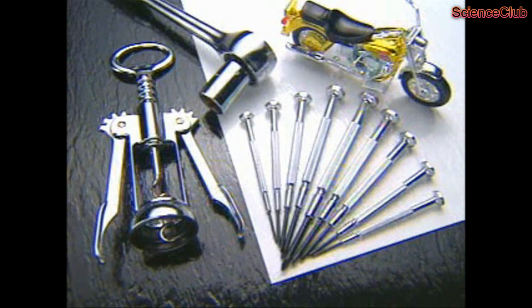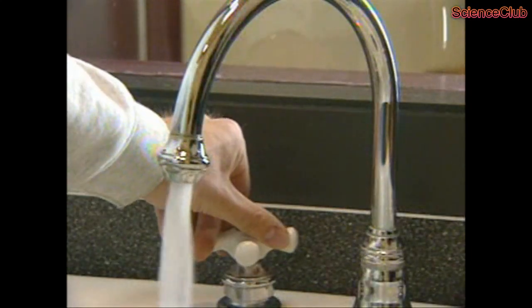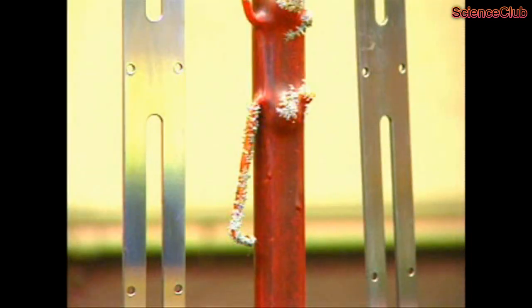Everyone appreciates the shine of chrome, but chromium ore is not overly abundant and therefore expensive. Also, pure chromium is a brittle metal that is hard to work with. How then can just about anyone afford beautiful chrome accessories? This is accomplished by the deposition of chromium ions onto a base metal using electrolysis in a process called chromium electroplating.